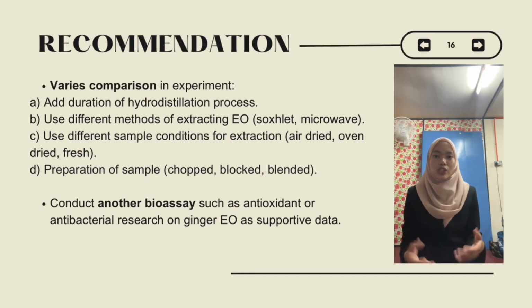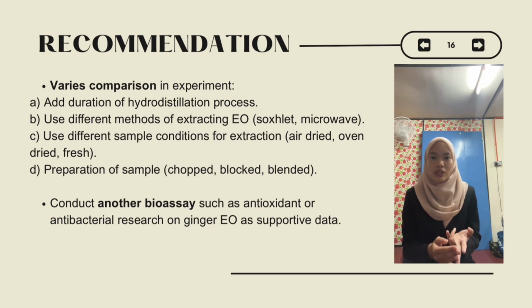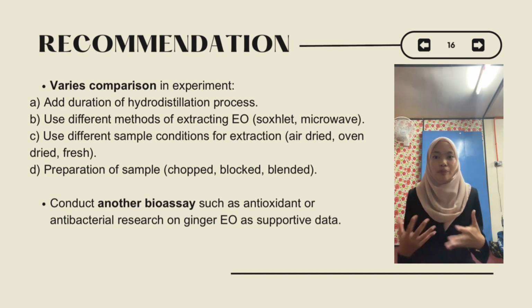So firstly, to vary the comparison in the experiment. The idea is to either extend the duration of hydrodistillation from 7 hours to 12 hours, or to use different methods of extracting essential oil, such as solvent and microwave-assisted hydrodistillation. Next, we can also use different sample conditions for extraction, like air-drying or oven-drying the sample. And then we can also change the sample preparation method by blending the sample, other than chopping the sample.